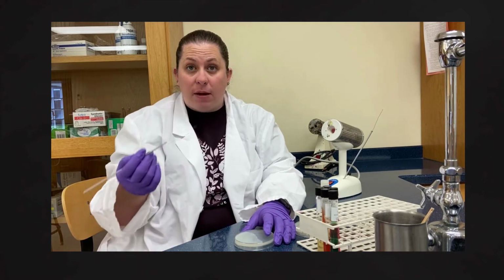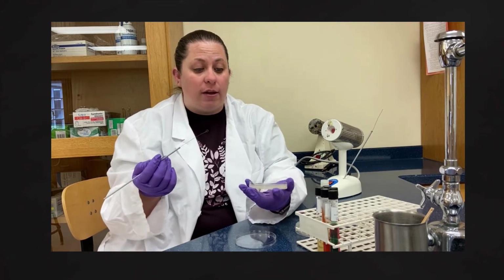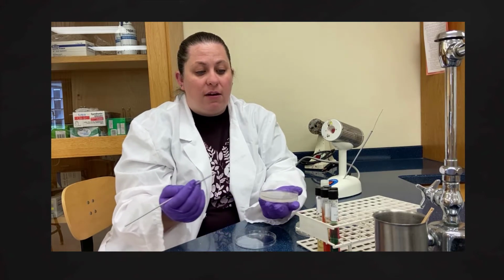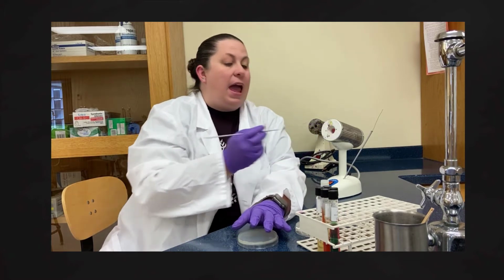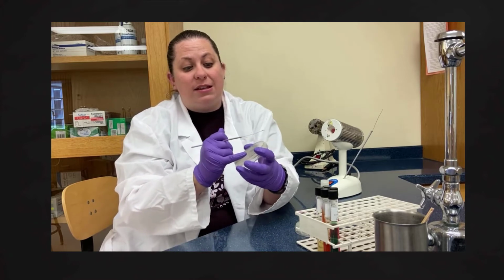I'm going to then go through quadrant 3, again pulling from number 2 into 3, but only pulling hopefully a few of the bacteria. The whole point is if we can get an isolated bacteria to go through the process of growing, that's going to be that isolated colony. So again, I'm going to go back and forth in that area. And then I'm going to do my 4th quadrant where I'm going to go through what's left into the middle.